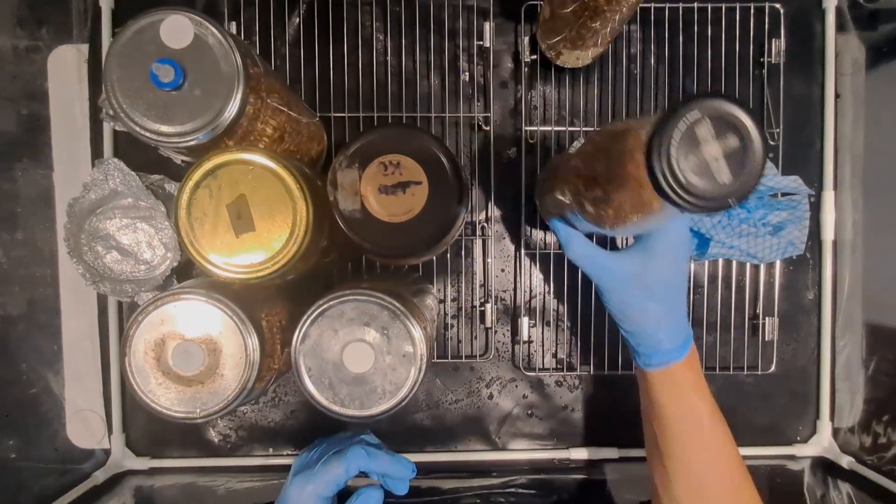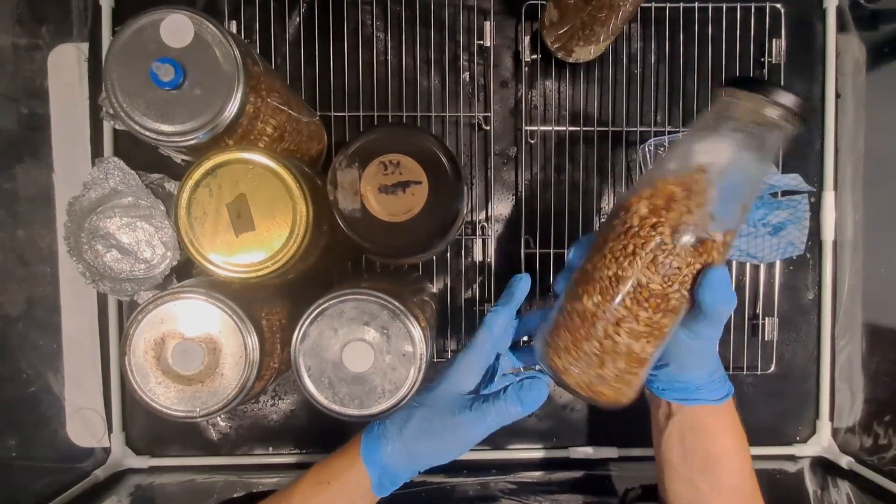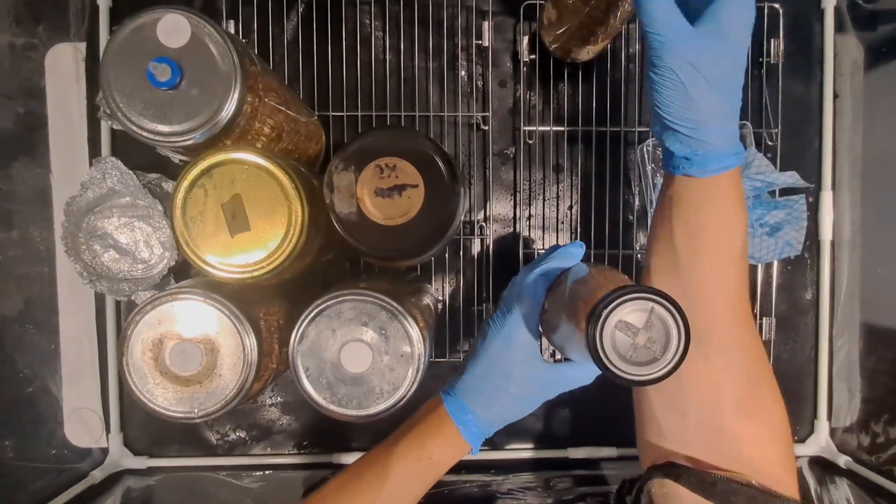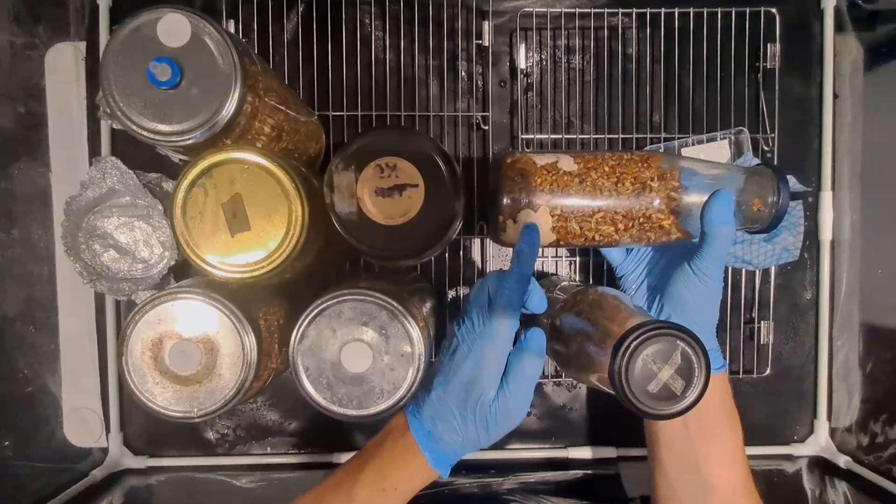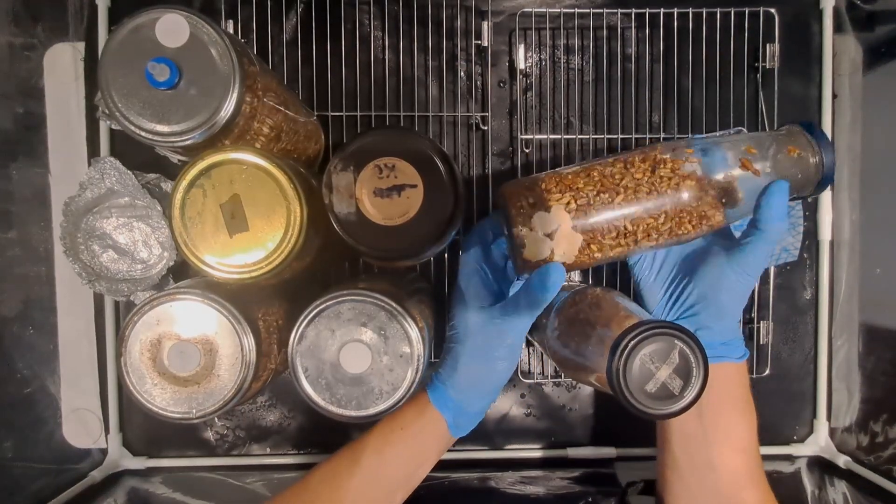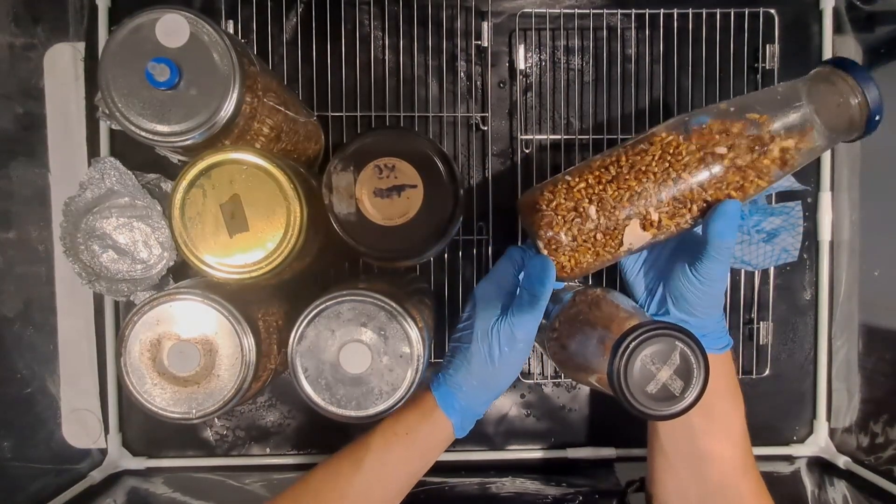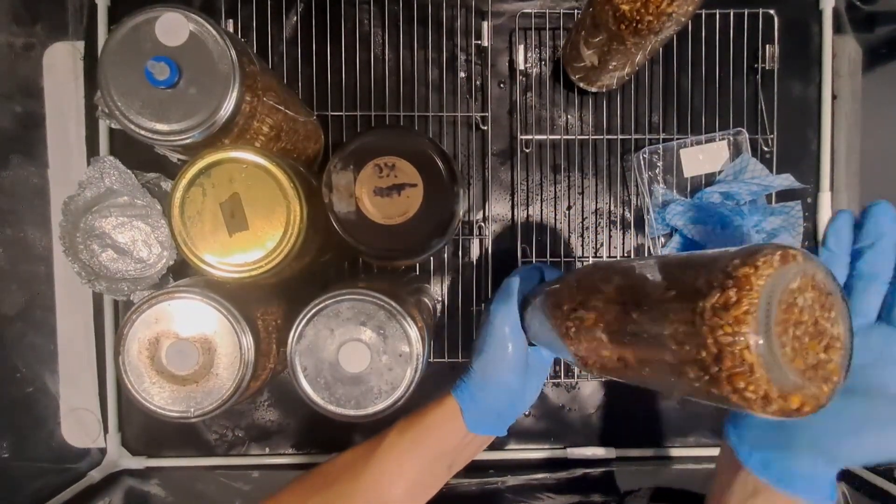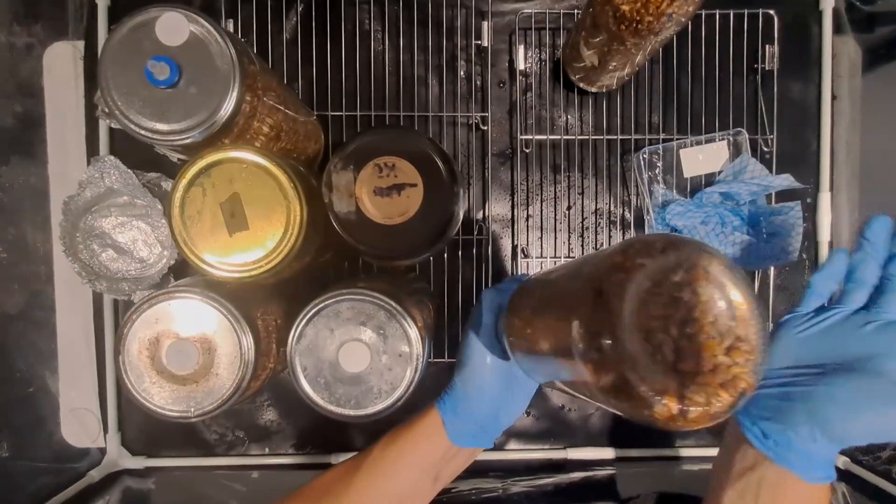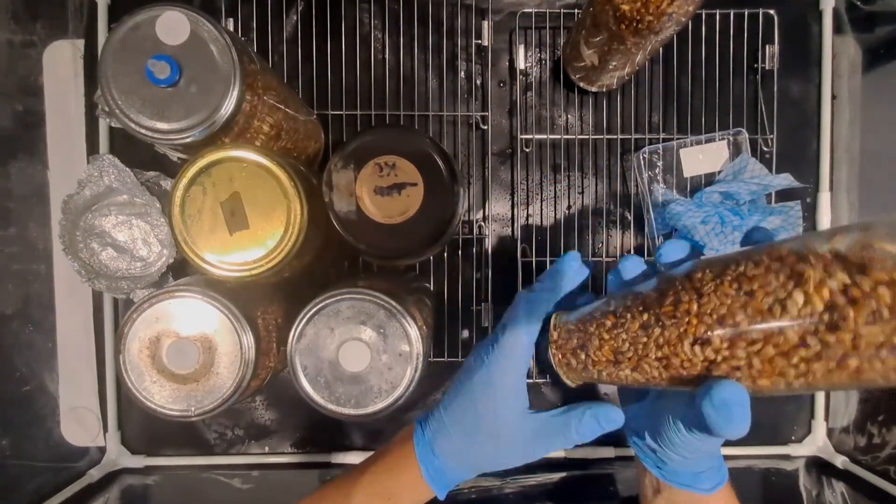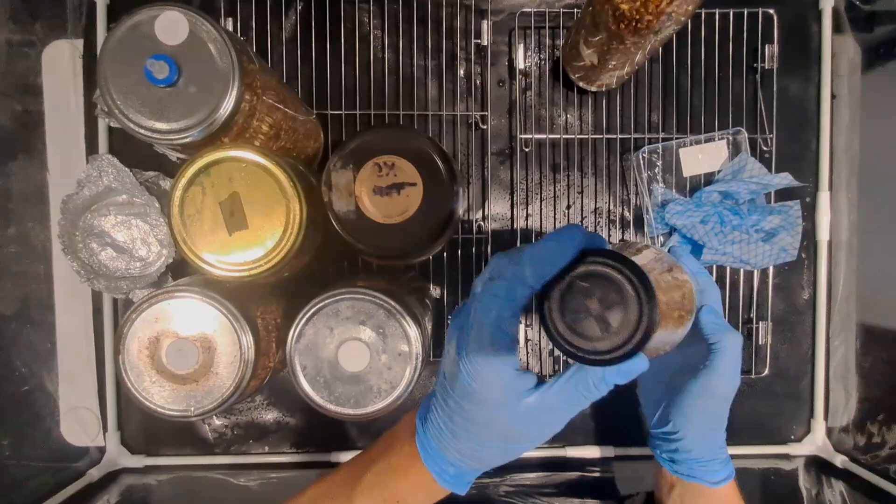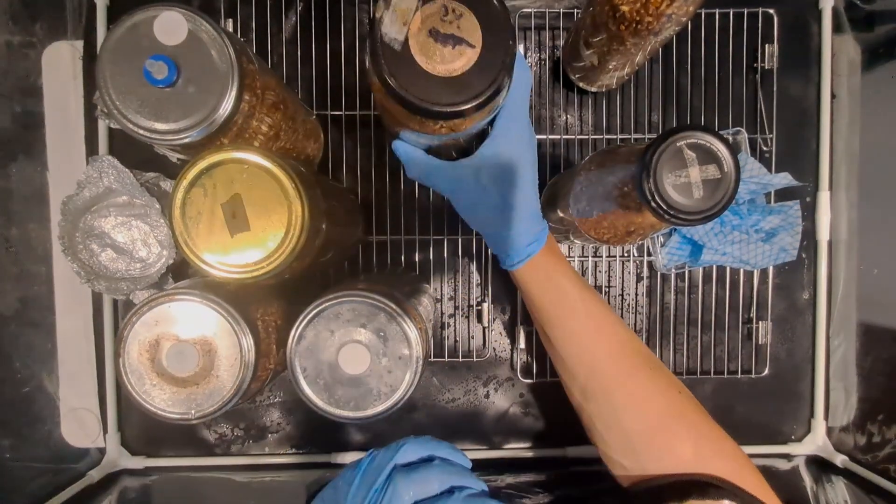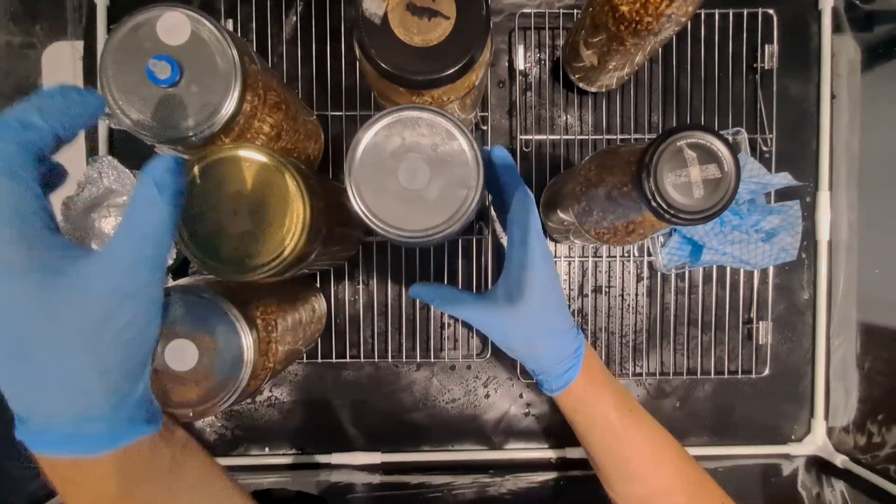So this is the donor jar. It doesn't look like it's got grain spawn in it because it's had a shake and a breakup. Normally you can't see the grain spawn after you've done a shake but if we have a look at this other jar which was way over colonized you can see the turkey tail which the grain spawn had started to create a stipe where the mushroom was fruiting in the jar. I'm just getting the grain spawn nice and loose here so it's easy to pour.